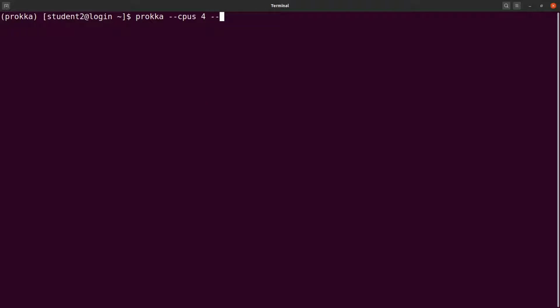We also specify prefix. We have the prefix here. Let's say Agy99. So the prefix here allows PROKKA to give a name to all the files that will be generated, in addition to their respective file extensions. So what will happen is that all the files generated as a result of this annotation process will have Agy99 in their names, in addition to their respective file extensions.